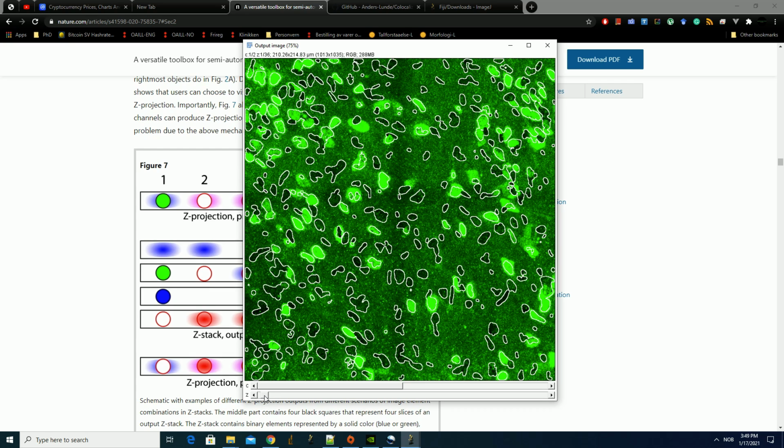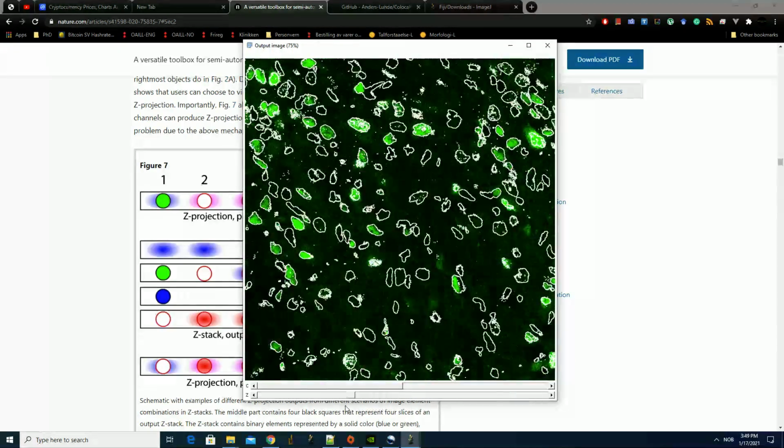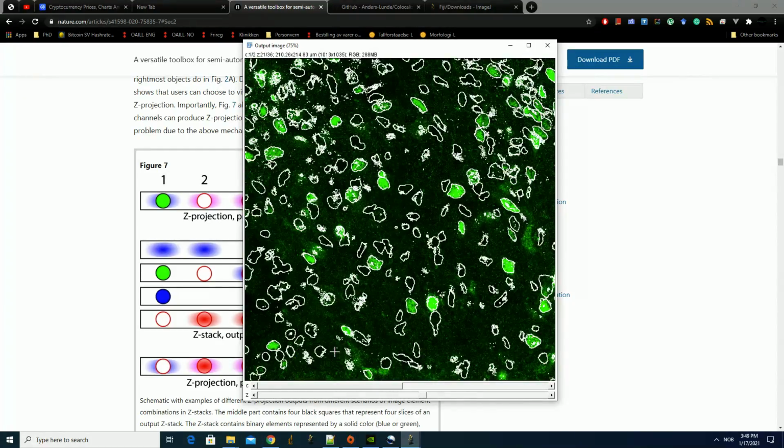And if I go to the next one, then we look into this actual set stack. But the idea here is that let's try to look only at this top slice as much as we can, because then we don't have to go into the stack all the time.